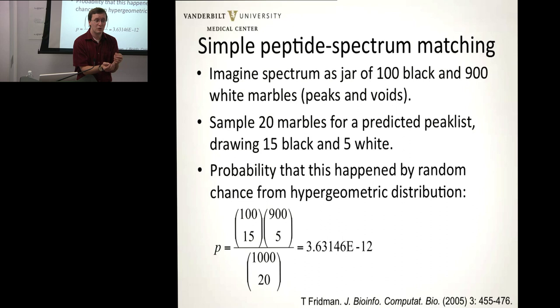But in reality, we generally predict a much larger number of fragment ions than we can possibly match in the tandem mass spectrum. Frankly, a lot of the software uses such a bad model of how peptides break that it predicts really unrealistic locations like B1 that A doesn't form under CID conditions and B would fall outside the scan range anyway. So let's just say that our predictions are hyper-aggressive and we only expect some number of these ions to match anyway. Okay, but how good is it if I match 10 of 20 ions or 8 of 20 ions or 15 of 20 ions?